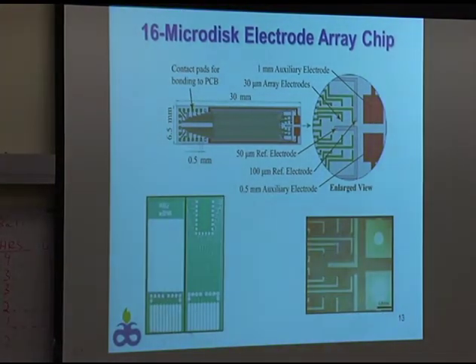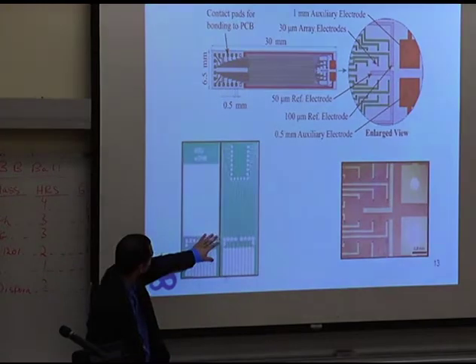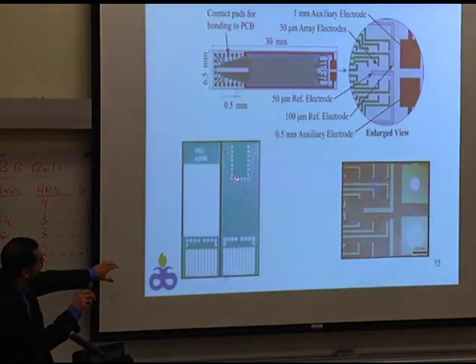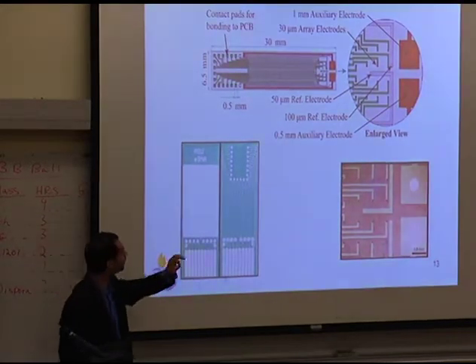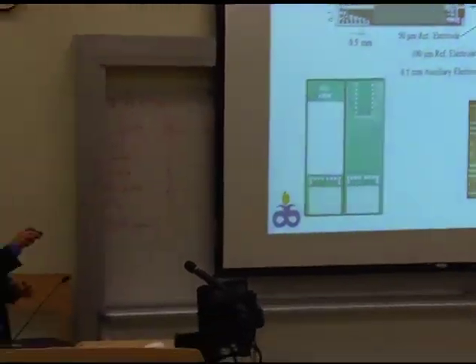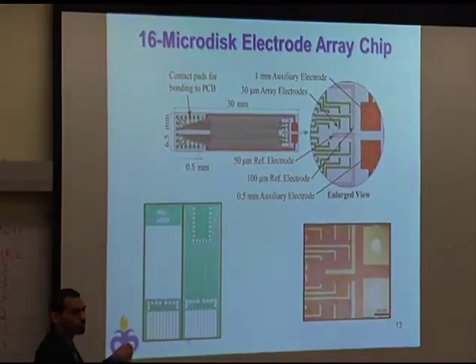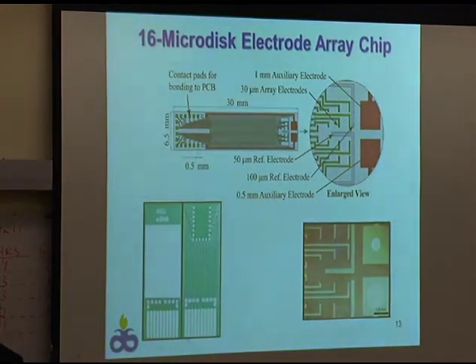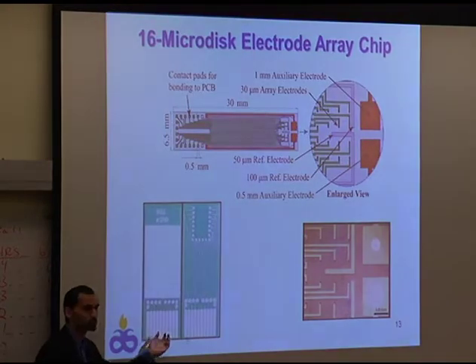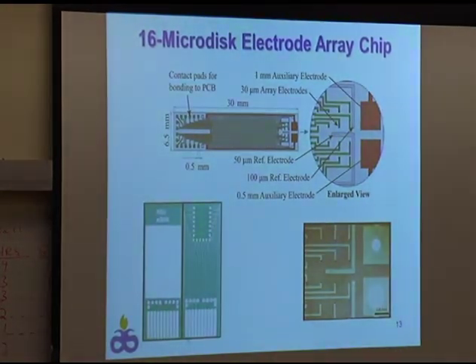So how do we connect this to our potentiostat? Well, we've already developed this PCB board, printed circuit board, and if you notice the pattern here, it's very similar to the pattern here. And what we have here are solder bumps. So tiny amounts of solder have already been applied here when we ordered them, and all we have to do is take the chip. So this is my chip. I take that chip, align it with these, that is pretty much self-aligning, put it on a hot plate, heat it to a certain temperature, the solder bumps melt, and it attaches the chip to my printed circuit board. I need this printed circuit board so I can just connect it. It inserts into the chip connector on my potentiostat. Real quick electrical contact to the potentiostat.